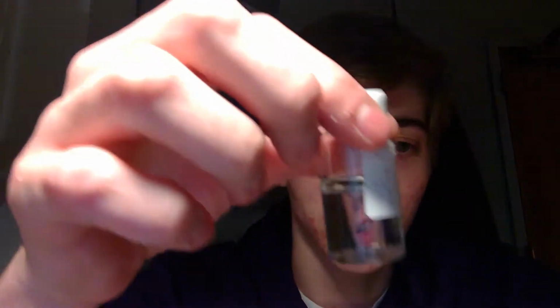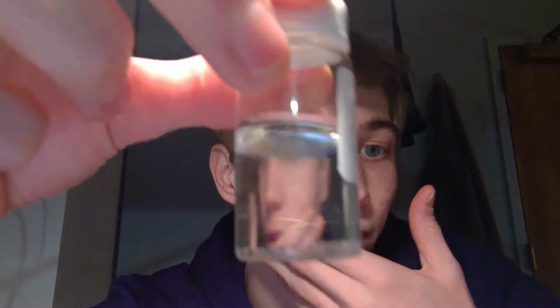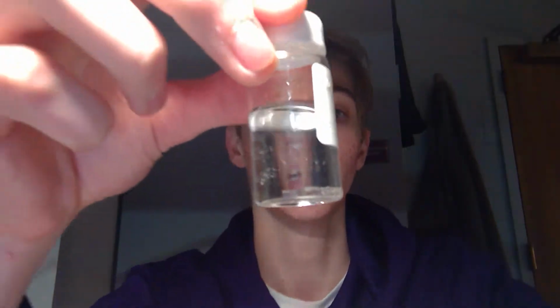My crystals have grown a lot since the last video. The seeds of nucleation have grown to form larger crystals, and the solvent level, the liquid, in the vial is noticeably lower, meaning that a lot of the solvent has evaporated.